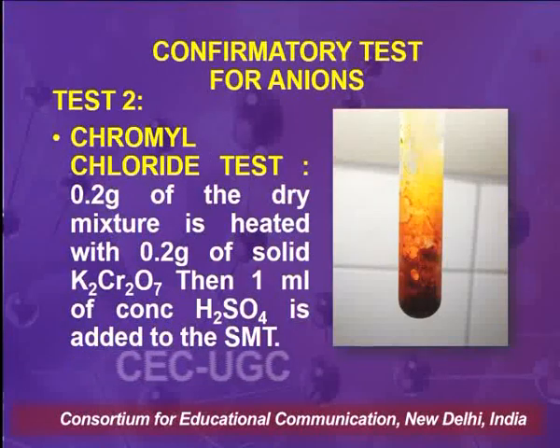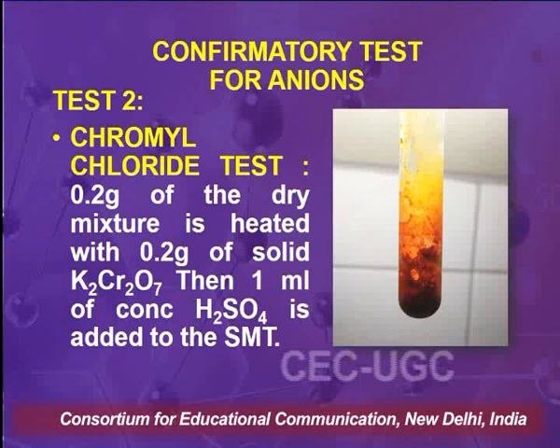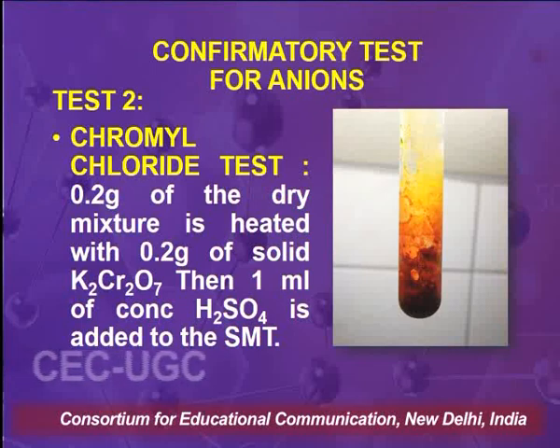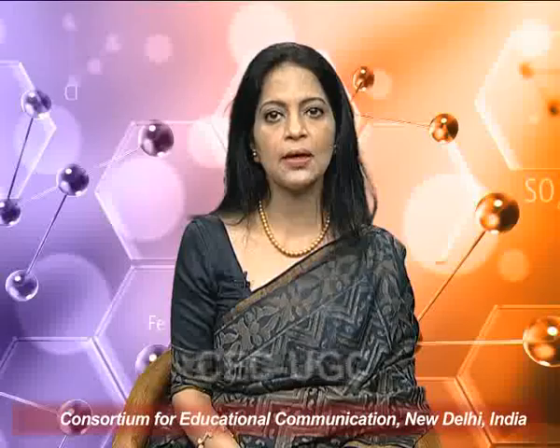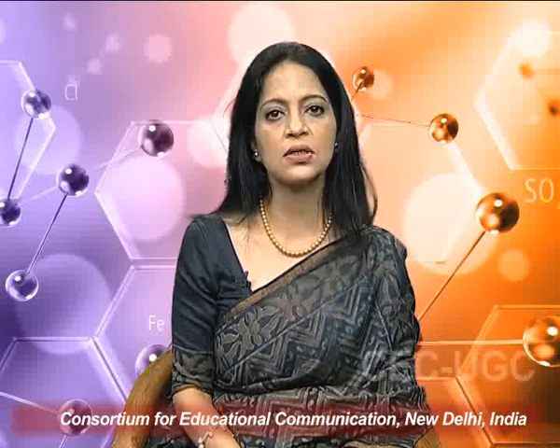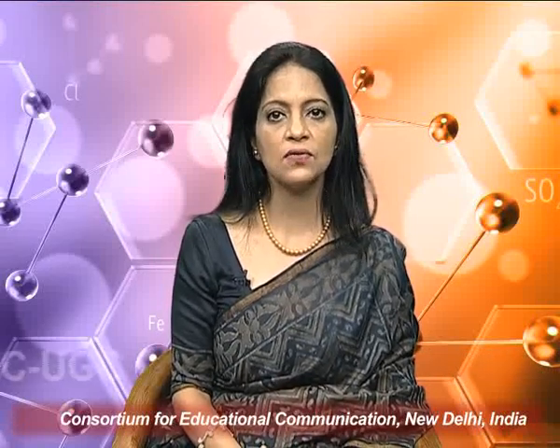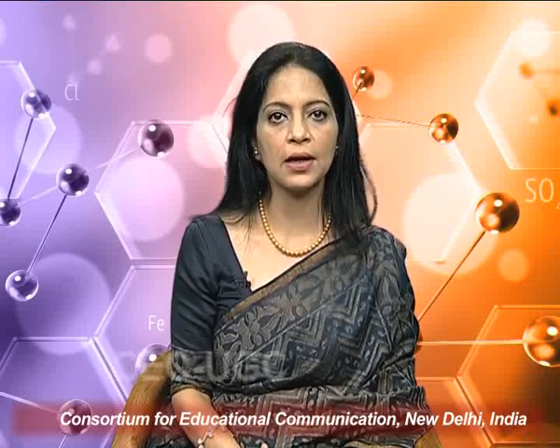And as it can be seen in the picture, there is the evolution of orange-red vapors on the addition of potassium dichromate and concentrated sulfuric acid to the dry mixture. The vapors which are observed are of chromyl chloride.